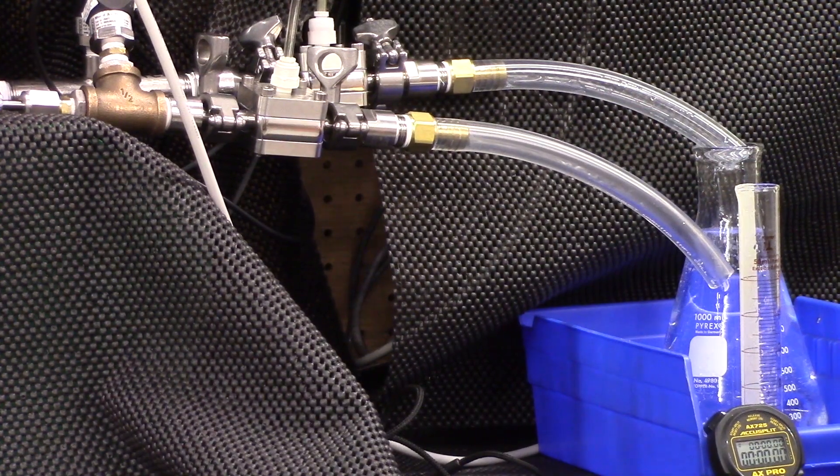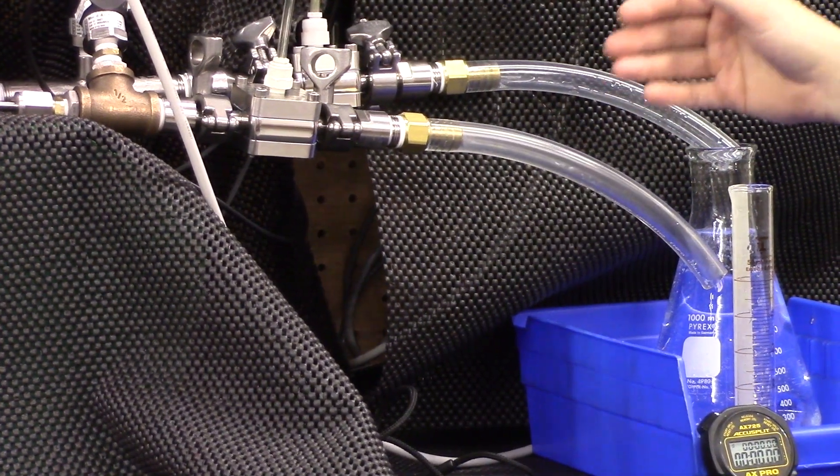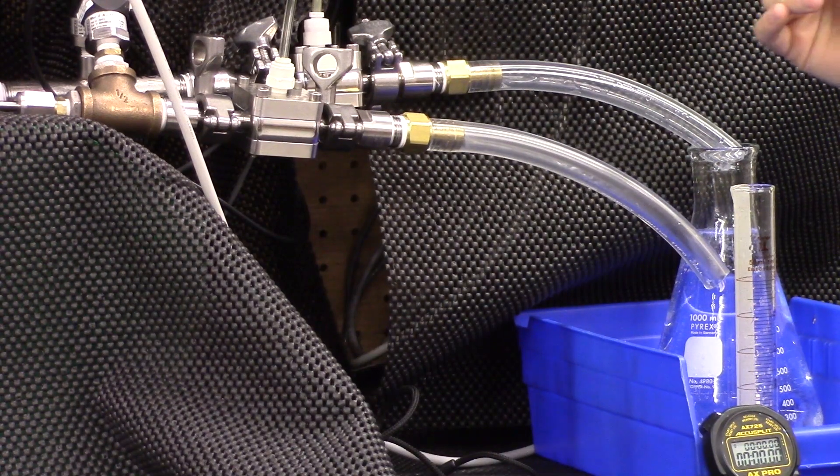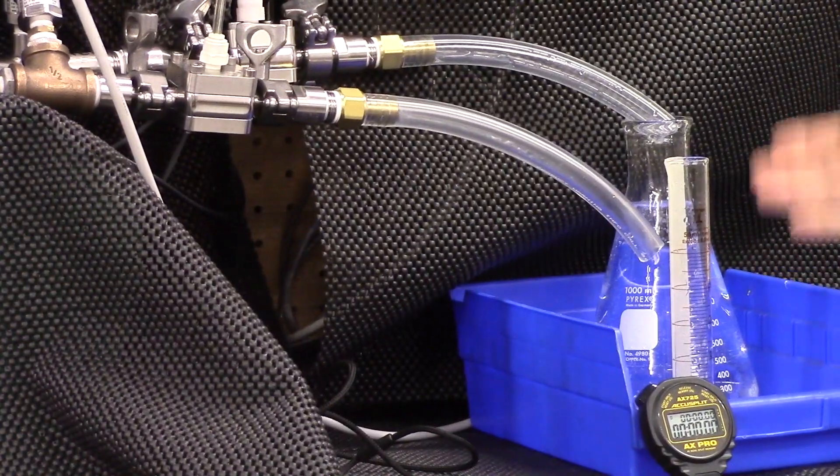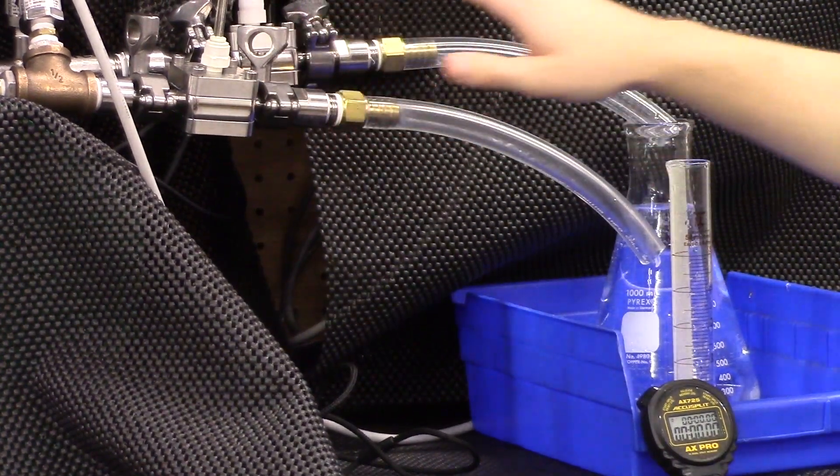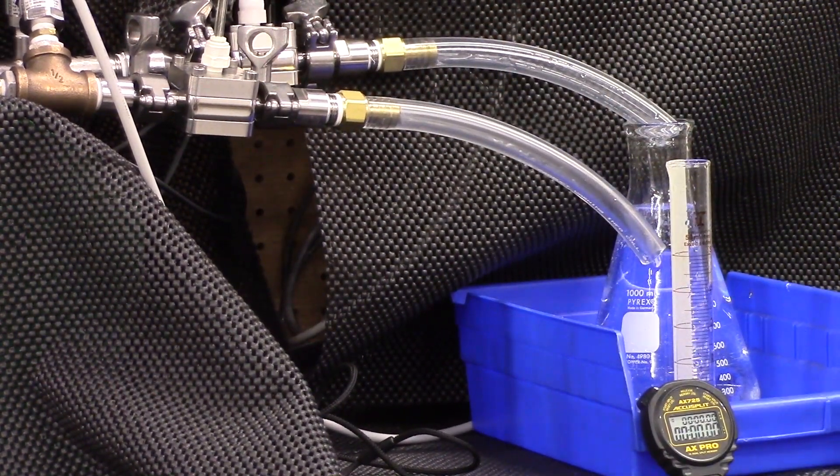From the outlet of the back pressure regulator, it exhausts directly to atmosphere. In a typical inline conditioning system, like we stated earlier, this would feed a supply pump or your skid downstream. In this case, we're going to use two different volumetric containers comparing these two identical back pressure regulators at a 100 to 1 flow turn down.